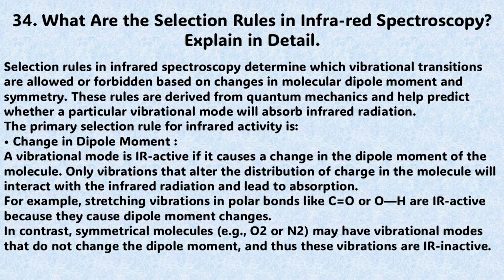Only vibrations that alter the distribution of charge in the molecule will interact with the infrared radiation and lead to absorption. For example, stretching vibrations in polar bonds like C=O or O-H are infrared active because they cause dipole moment changes. In contrast, symmetrical molecules, for example, O2 or N2, may have vibrational modes that do not change the dipole moment, and thus these vibrations are infrared inactive.